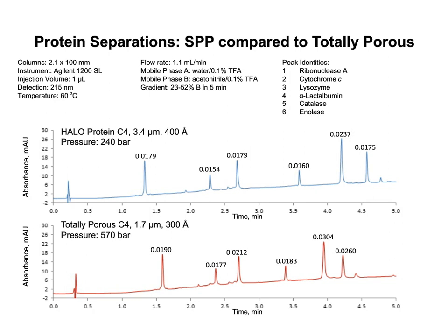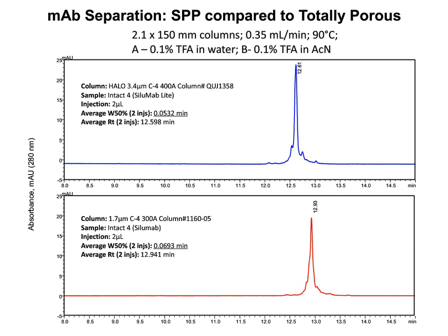And as you can see, at the rather high flow rate, in all cases, protein bandwidth, that is the broadness of the peak, is reduced for a superficially porous material. Moreover, the back pressure, as measured at the LC pump, is considerably lower for the 3.4 micron particle diameter. So there is an advantage, even relative to much smaller particles, for a superficially porous structure.